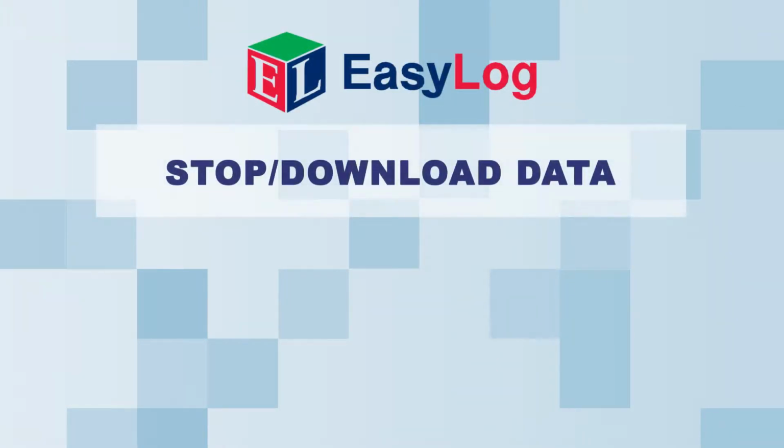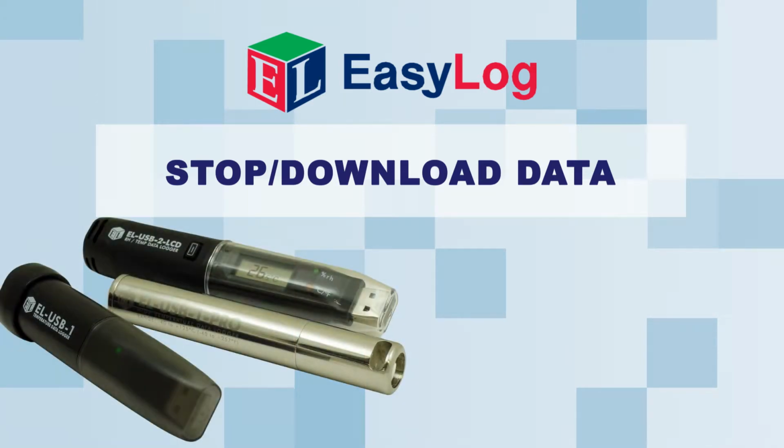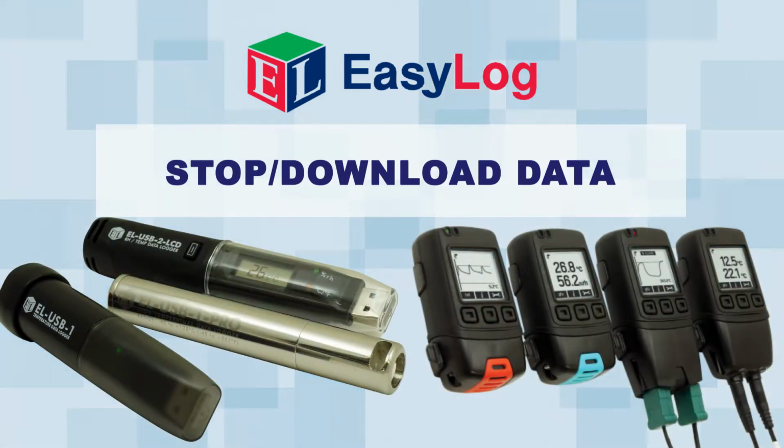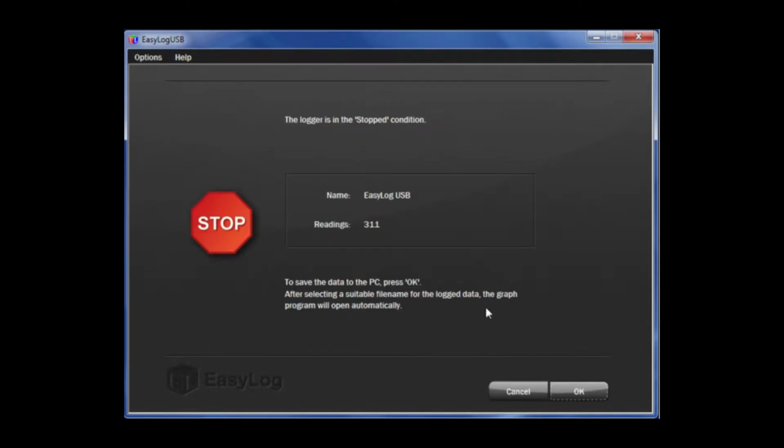In this video, I will be showing you how to stop and download data from your EasyLog USB or GFX data logger. Today I'm using an USB2 LCD data logger. To begin, click Stop the USB data logger and download data.